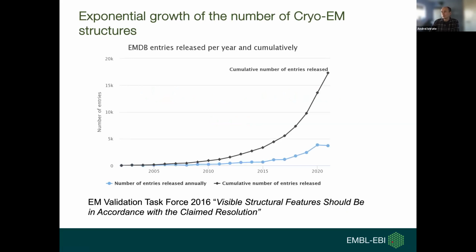Cryo-EM, as you all know, is growing fast. And with these numbers, it's really important to have good validation tools to keep the data of high quality. So to tackle this, over the years, several validation task forces were organized, where basic principles and the methods for validation were formulated. And at one of these meetings, it was stated that visible features should be in accordance with the claimed resolution.